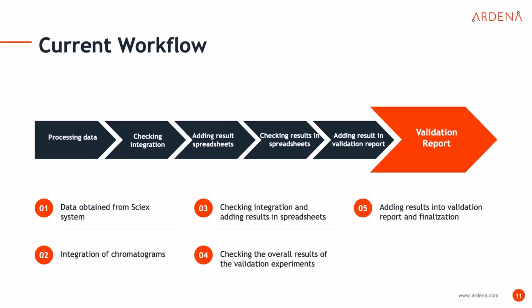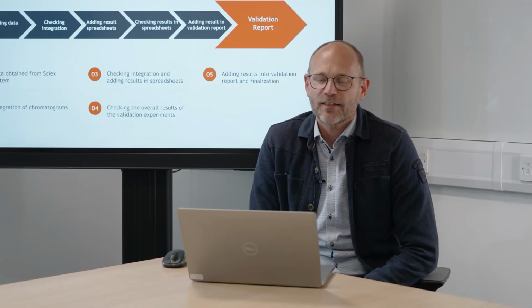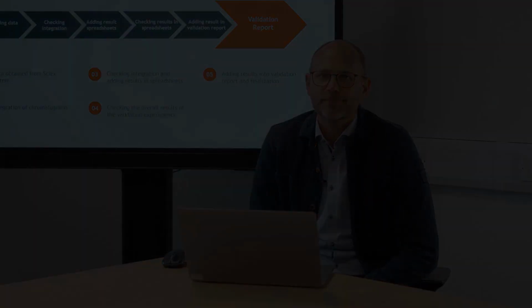Data is finally transferred into the validation reports. This process is labor-intensive, error-prone, and difficult to scale up. It also introduces risks to data integrity and compliance, and we hope that SCIEX software can help with that. Now I've gone through the ICH M10 and I give the word to Heather.